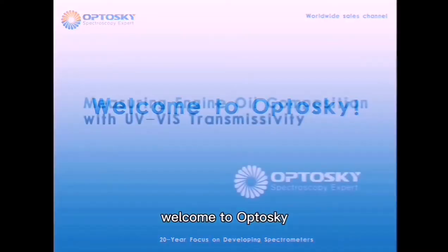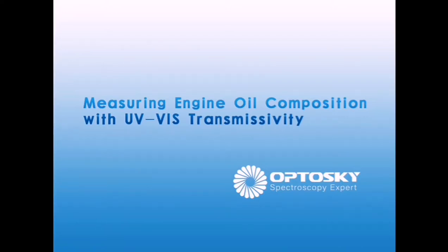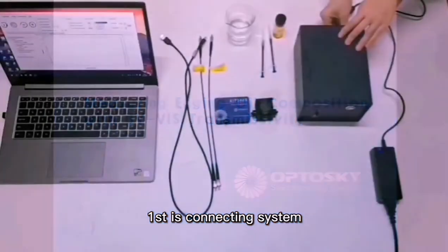Welcome to OptoSky. Today we will measure engine oil composition with UV-VIS transmissivity. First is connecting the system.